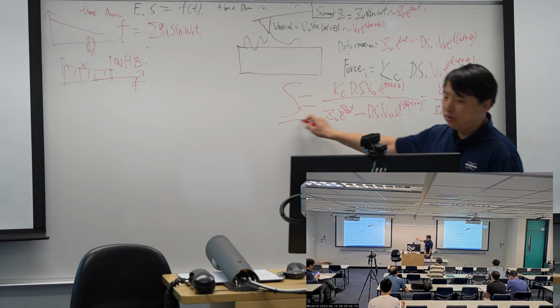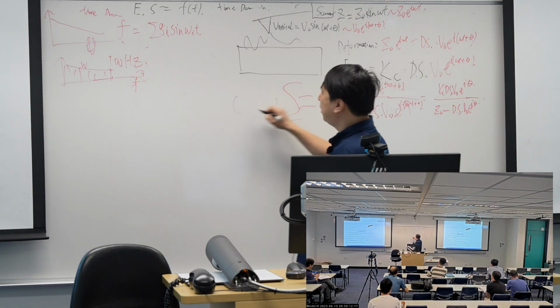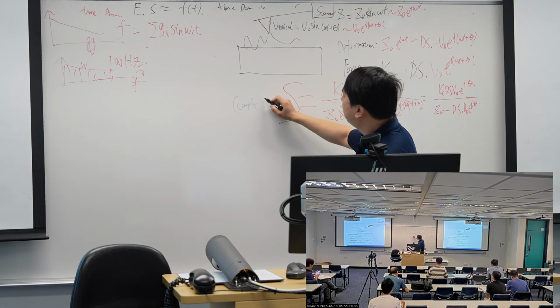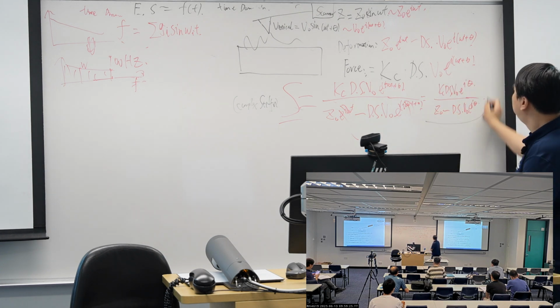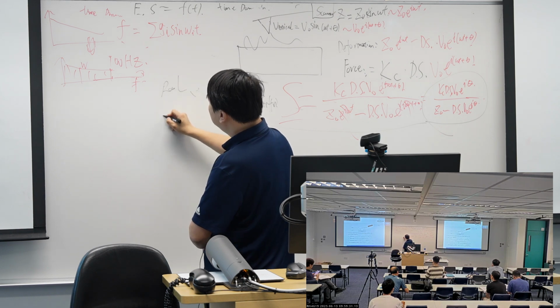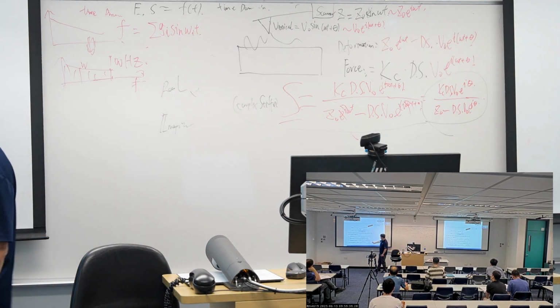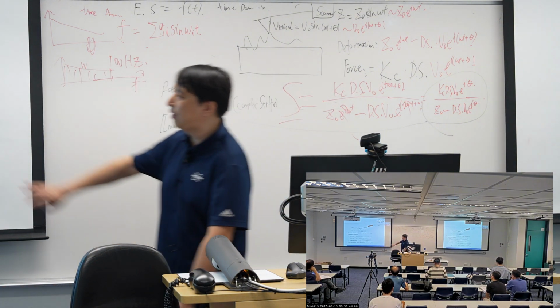And for the stiffness, you can use a similar concept. We call it a complex stiffness. From this, you get the storage part, the real part, and the imaginary part. The final one is read out like this. That's our final result.